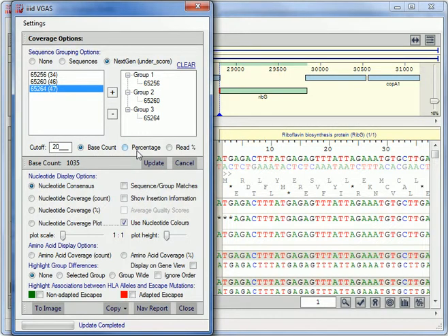The percentage option is more suited to FASTA or Sanger. The entered value is used at each nucleotide position and includes any unsequenced areas, shown as asterisks. The read percentage option is more suited to next gen. The value uses the read depth at each nucleotide position and ignores all rows where no read is found, i.e. there's an asterisk.